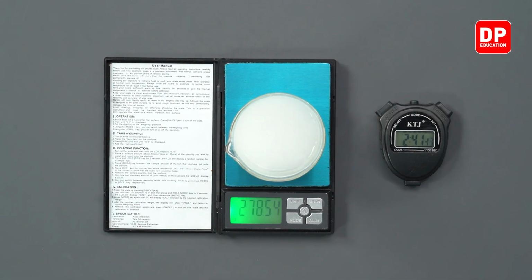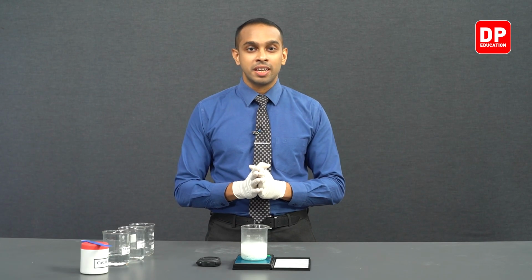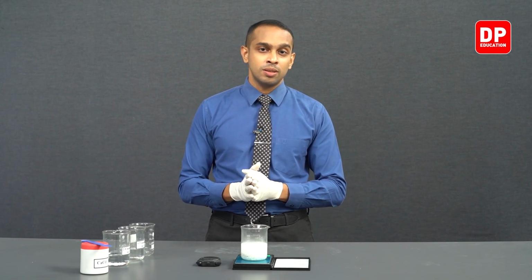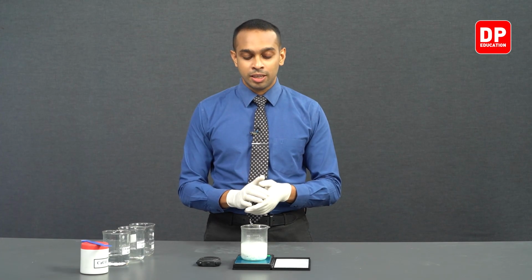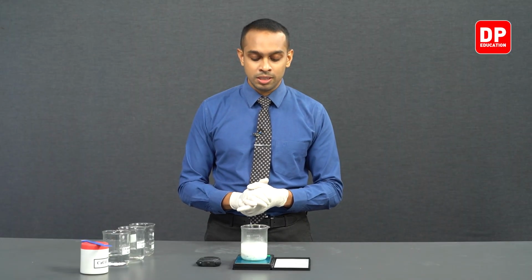278.51. So students, now we have taken 8 readings. You wouldn't need all of these 8 readings, but in case you do need it, that's why we go up to 8 readings, but you can actually stop it when you have fewer readings than this.